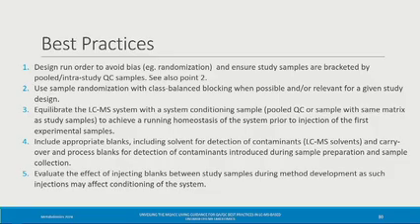So that might be something we have to consider. If you have thousands of samples, especially in a biobank setting where you have to put your samples back to originally where you put them from, which shelf, which box, which arrangement, it can be a very practically challenging thing for a minimal theoretical bias that we might face.